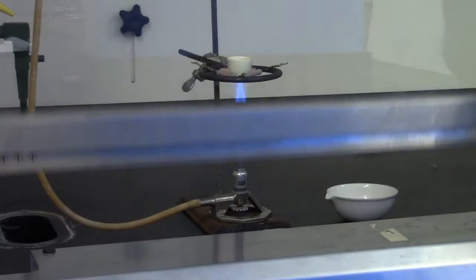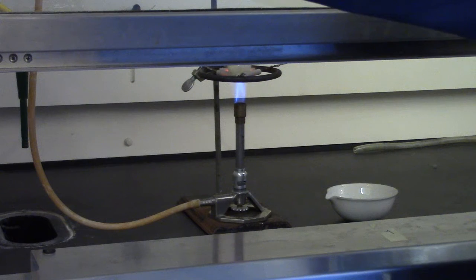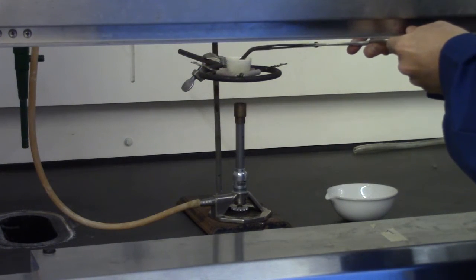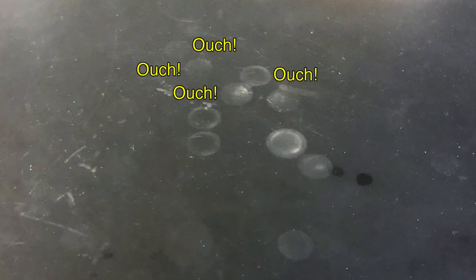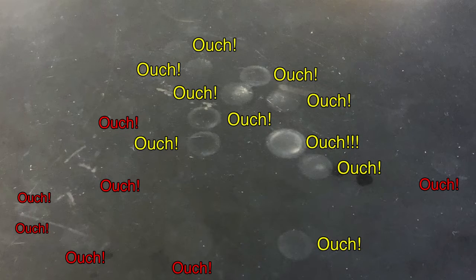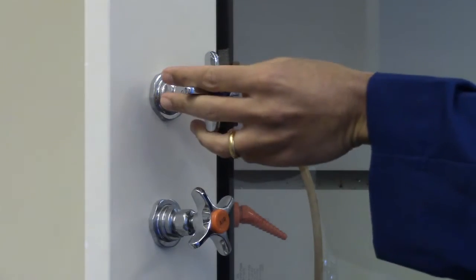Remove the crucible and place it on wire gauze or your evaporating dish to cool. You will use the dish to carry the crucible to the balance. The countertop can take the heat, but it leaves a circular mark. Remember to turn off the Bunsen burner.